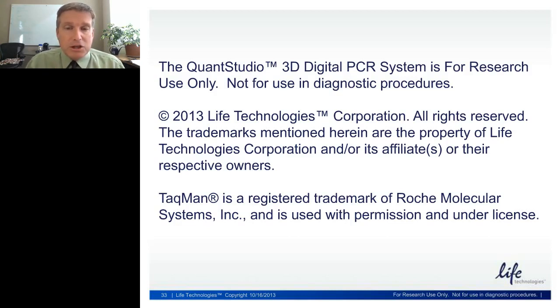Okay. In digital PCR, you don't have that problem. It's an endpoint where you either detect only the mutant or only the wild type. If you have one copy of each in a well, there's no way for the wild type to interfere or compete with your ability to detect the mutant signal. It just is not a problem. I hope that answers the question.